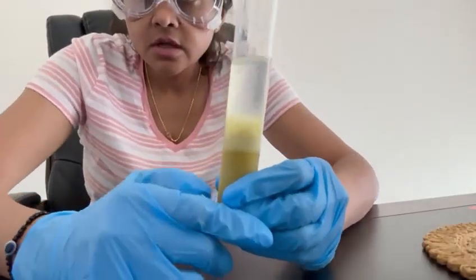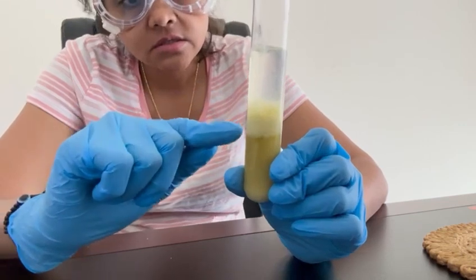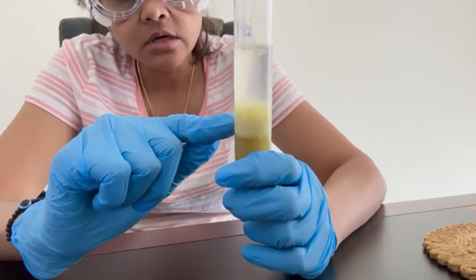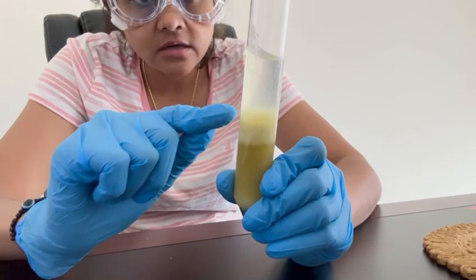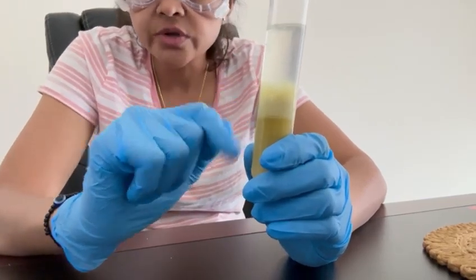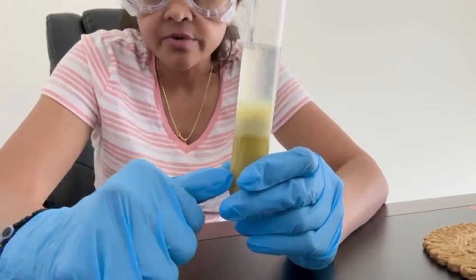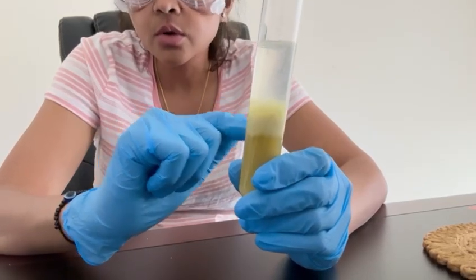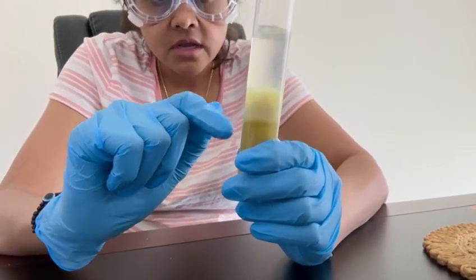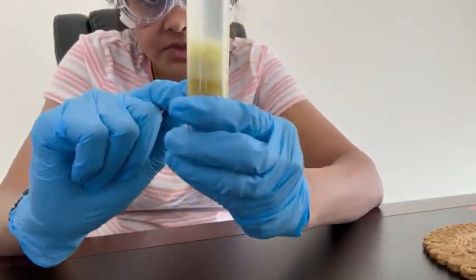After 1 minute, as I can see, there are two different layers. One is the white foamy layer, which is the DNA of the peas that we just extracted. It looks like a white stringy filament. The purpose of using chilled isopropyl alcohol is to increase the yield of DNA. As the temperature decreases, the percentage of precipitation increases, so the temperature overall affects the solubility and the DNA becomes more insoluble. And as we can see here, the DNA looks like white stringy filaments that we have extracted from the peas.